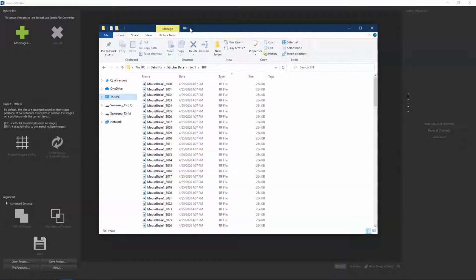So this is a set of 4 image stacks of a mouse brain, and each stack should contain 50 Z slices. The name of each of the slice files contains a stack number right after the sample name, mouse brain. And it also contains an underscore with the letter Z and the number that is basically the slice number. So this underscore Z is called a delimiter, and Imaris can track these to help set up data correctly when importing big data sets like this.